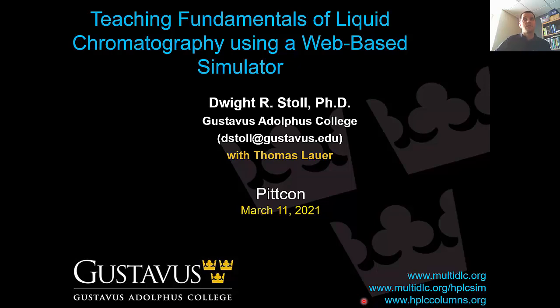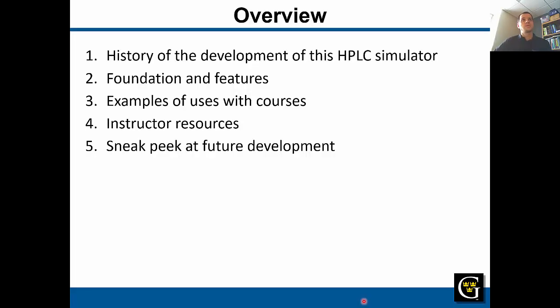So I'm going to talk today about our work over the past decade or so to develop a web-based HPLC simulator. I'll briefly talk about the history of the development of this tool, its foundation, and some of the key features. I'll talk a little bit about some examples of how I've used the simulator with my courses and point to some resources for instructors that are interested in using the simulator so you don't have to start from scratch, and give a very quick sneak peek at some of the future development that we're working on actively now.